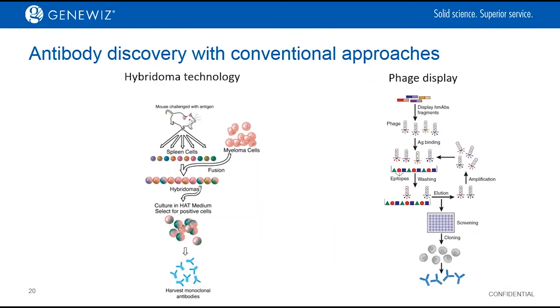The immunosequencing can be used in conjunction with conventional methods. For example, NGS screening of hybridomas can prevent the loss of positive clones. The NGS screening of libraries can determine their quality, which includes library size and diversity. NGS during the stage of panning and amplification can determine the enrichment factor, which is used for selection.